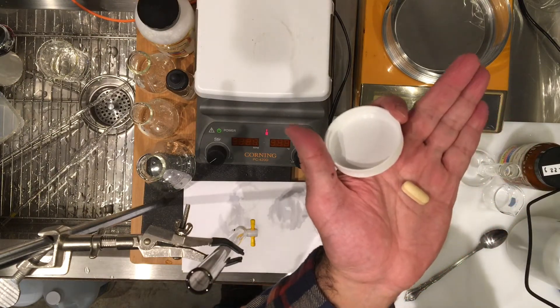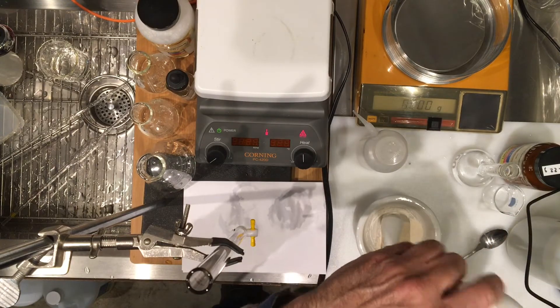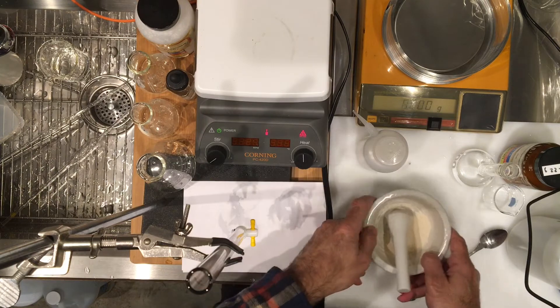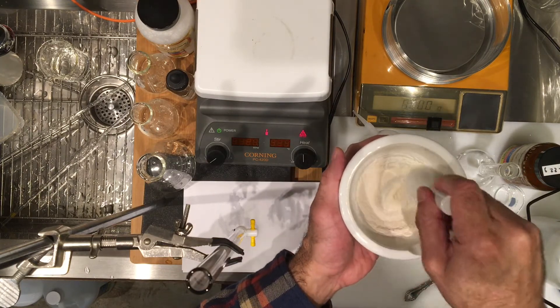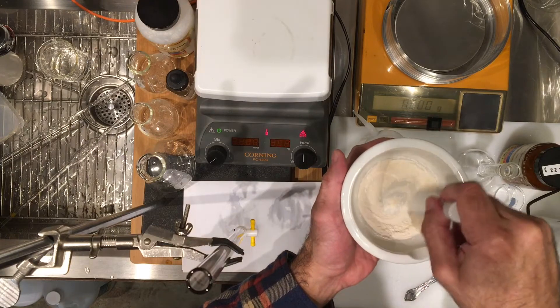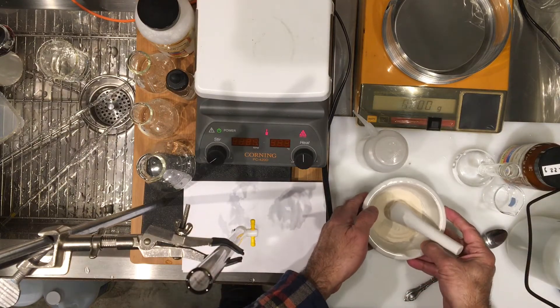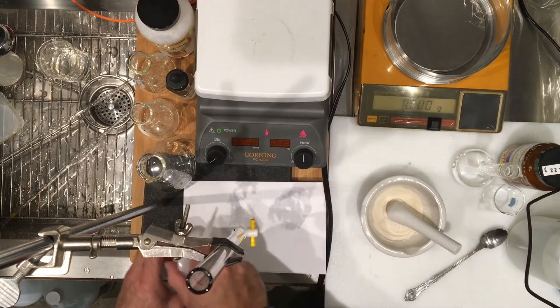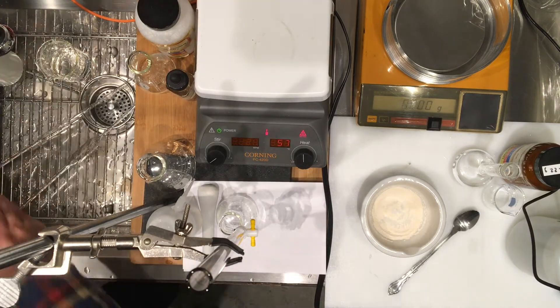I weighed one already — this is what they look like. We need to titrate, so we're going to have the tablets dissolve by grinding them. I took a couple of tablets and used my mortar and pestle to grind them to a fine powder. I want you to record these masses for our three titrations.